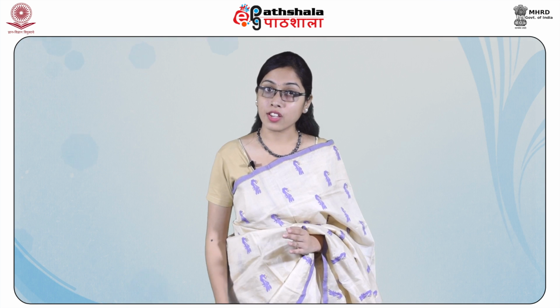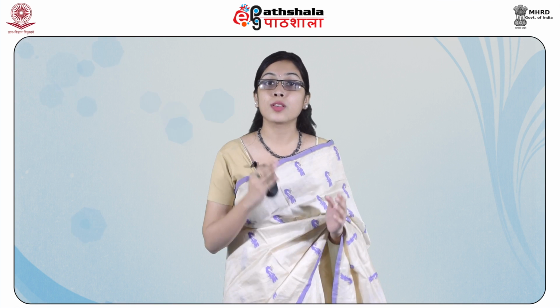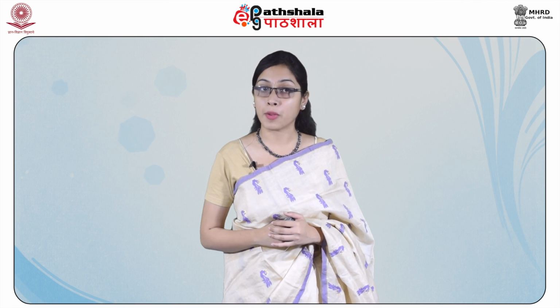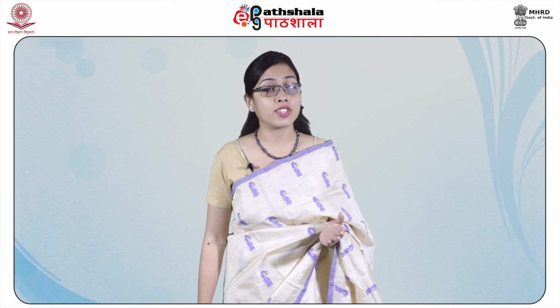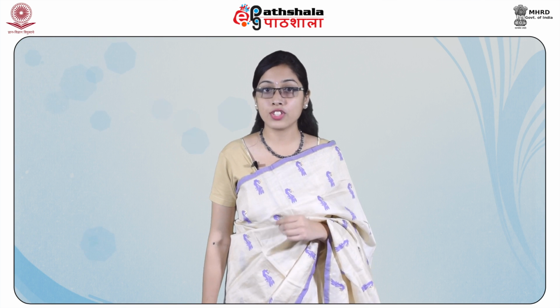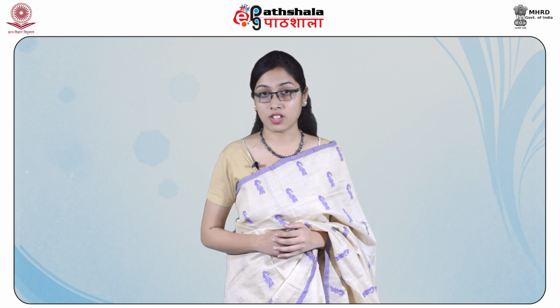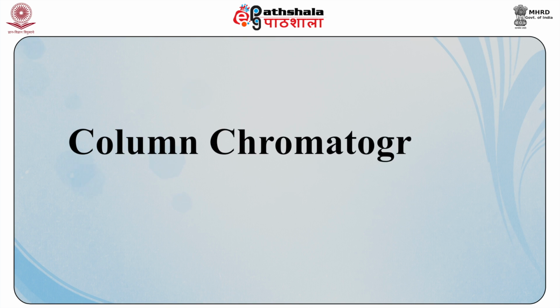Planar chromatography: in this type, the stationary phase is supported on the fibers of a paper or on a flat plate, whereas the mobile phase flows or moves by capillary action or under the influence of gravity through the stationary phase. The two major types of planar chromatography in use are paper chromatography and thin layer chromatography, also known as TLC.